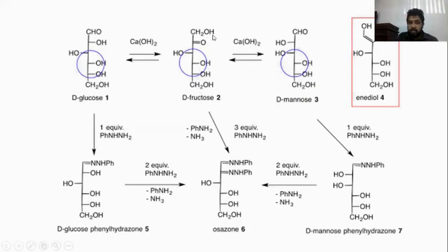Since phenylhydrazine reacts with only the first and second carbon of the sugars, the final product will be the same for fructose and glucose. Therefore, whether we use fructose or glucose, you will observe a needle-shaped appearance. The final product is the same, but the time taken to form crystals is different. Fructose will produce the final product within a short period of time, usually less than 2 minutes. But glucose will take about 5 minutes.